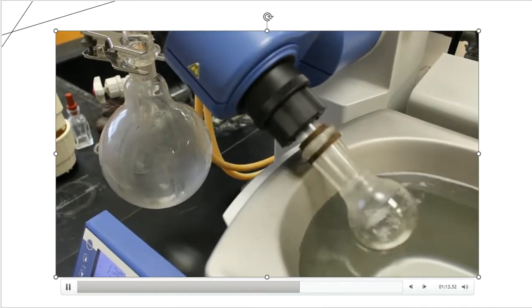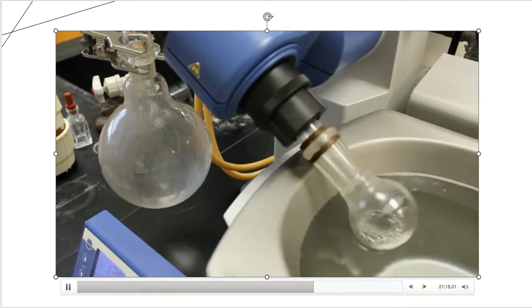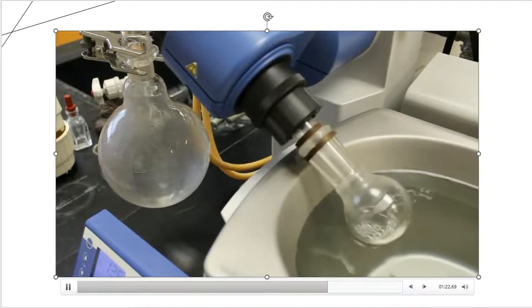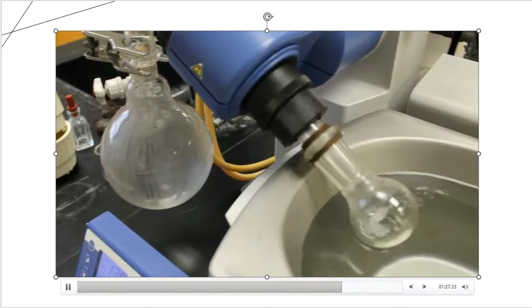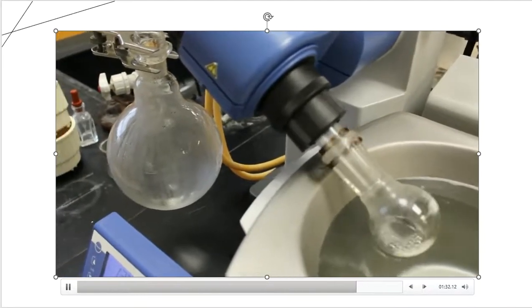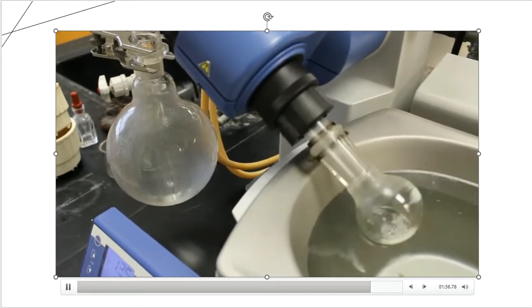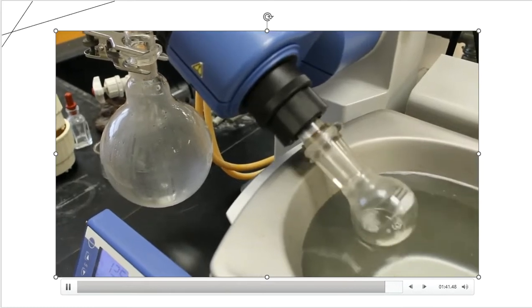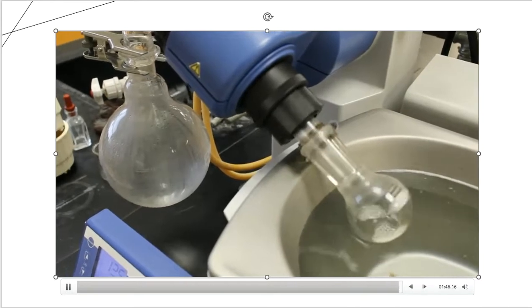Methylene chloride will eventually go away. I will not see those bubbles anymore when no methylene chloride is left over, and that's a very good sign for me to stop. At that point, I'll go to the next part of the lab procedure, which tells me to pour this onto a watch glass and let it do what it needs to do, and come back to it after it cools down to room temperature and somewhat dries out. That's what you're going to see me do next. And we'll just let the rotary evaporator do its job and continue to make my life very easy.